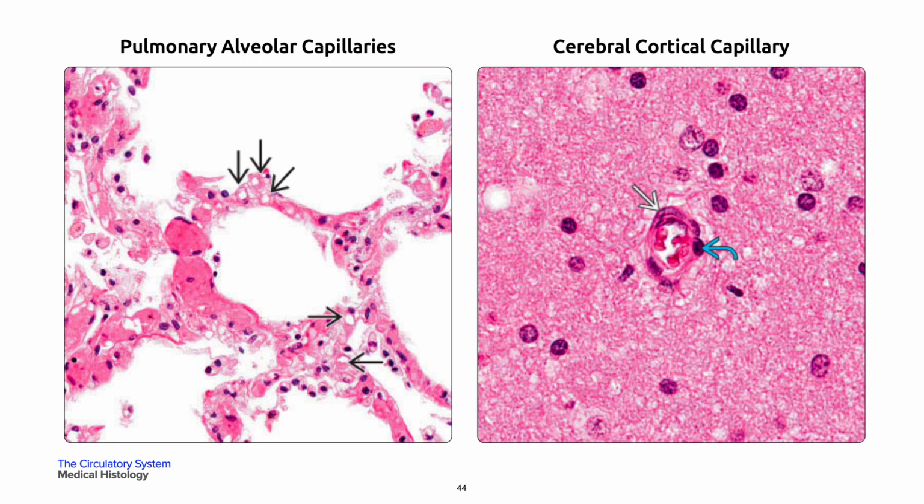On your right is a continuous type capillaries account for the blood-brain barrier, which limits solute exchange in central nervous system circulation. As with other capillaries, endothelial cells in a curved blue arrow and supporting pericytes in a single white arrow are seen by light microscopy.